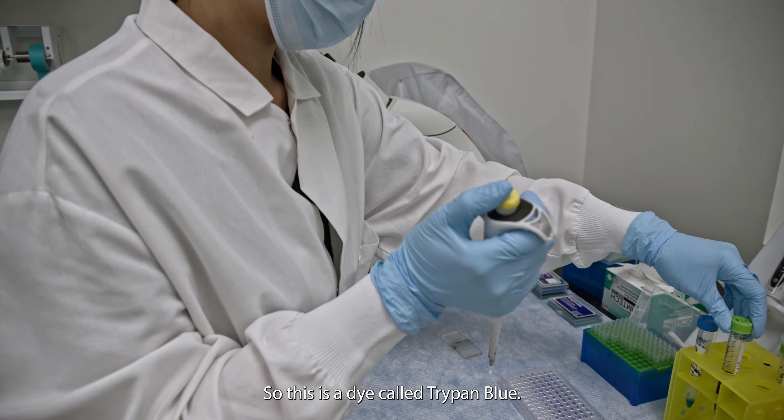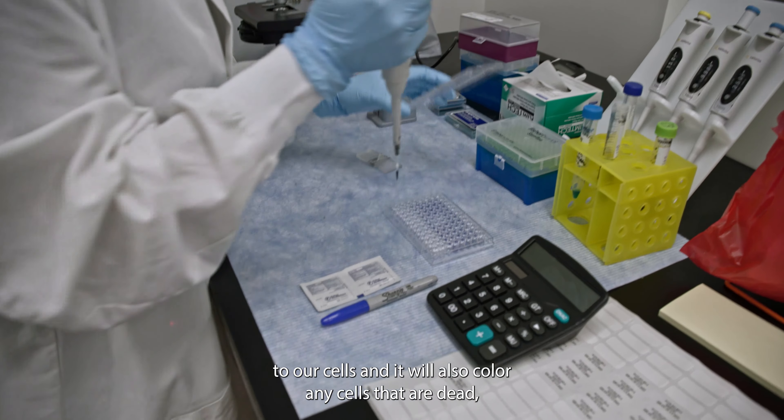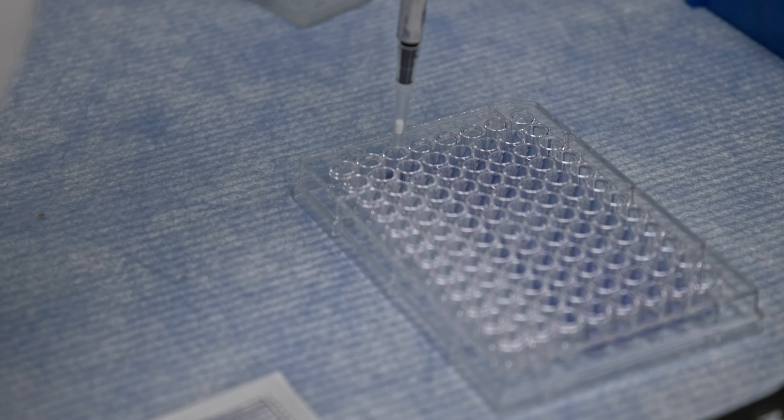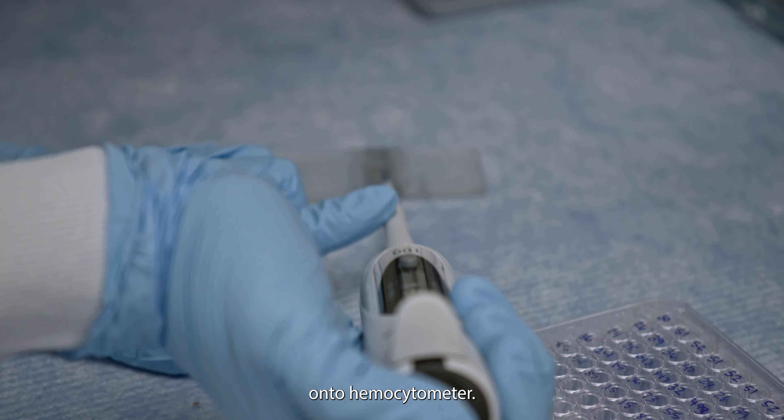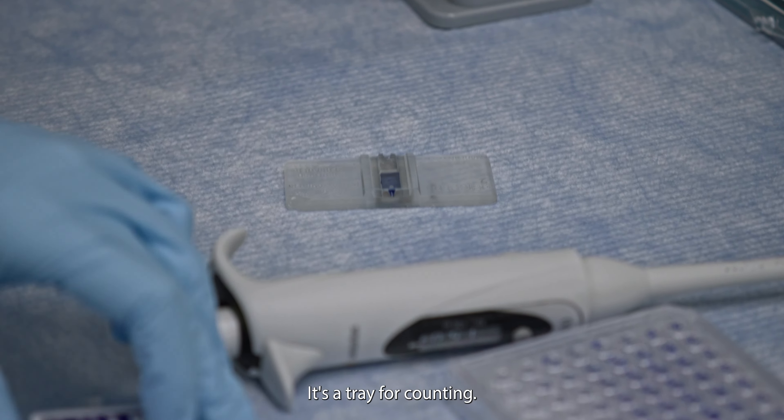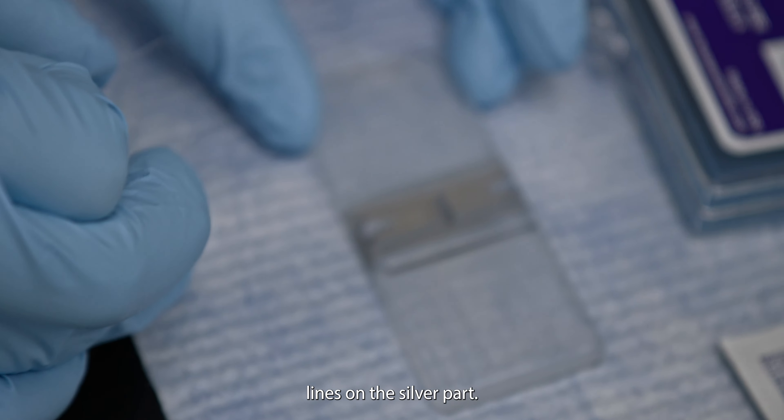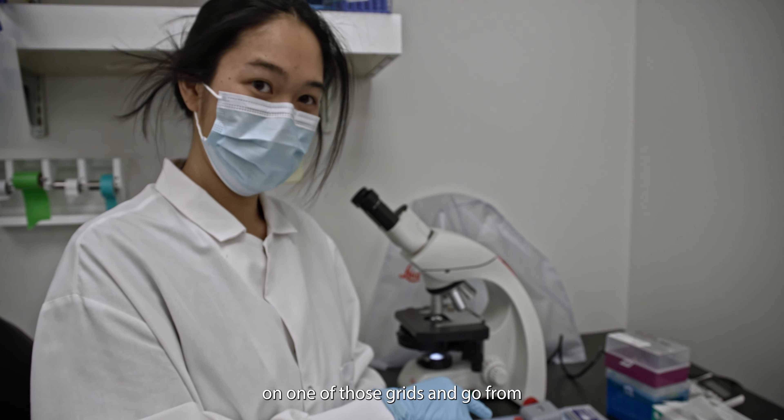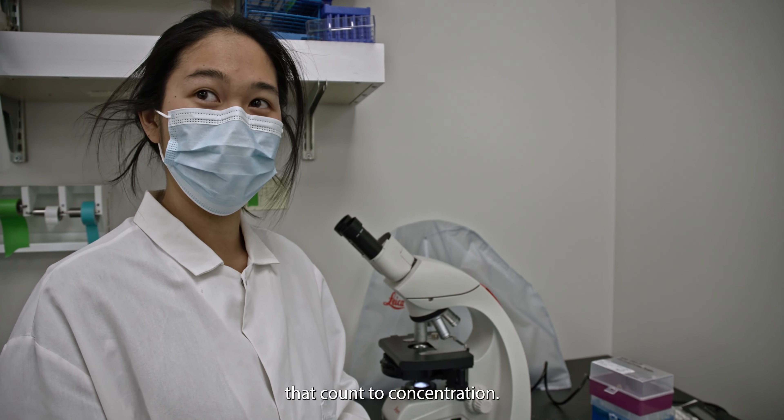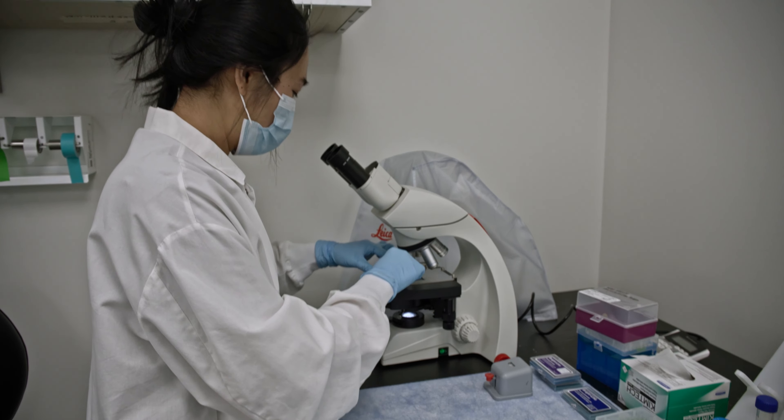So this is a dye called Trypan Blue. It will give a dark blue background to our cells and it will also color any cells that are dead a deep blue. So I'll mix that with our sample and load it onto the hemocytometer. It's a tray for counting. I don't know if you could pick it up, but you could see very tiny etched lines on the silver part. There's a way to calculate how many cells are in a square on one of those grids and go from that count to concentration. It's a lot of math that I just learned the shortcuts for.